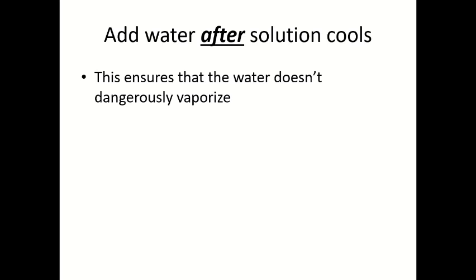Again, to specify, you need to add water after the solution is cold, right? This is because we have to make sure that water does not vaporize dangerously, right? If you add water into a very hot substance, what may happen is that water instantly evaporates and makes vapors too quickly, that can explode or can also damage you, damage your skin, or cause any other damage. So we have to make sure that water is added when the solution is cold enough.